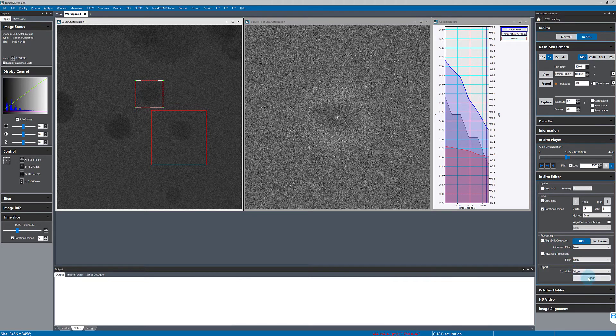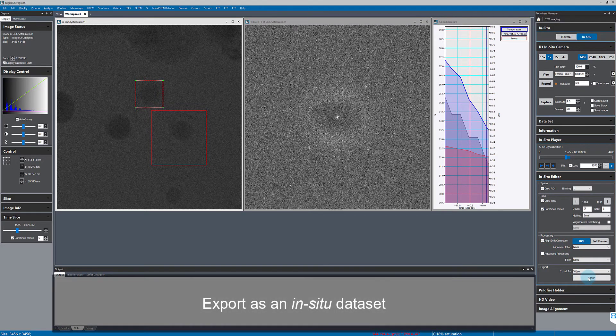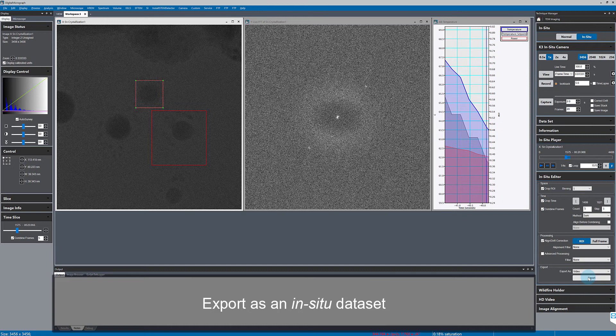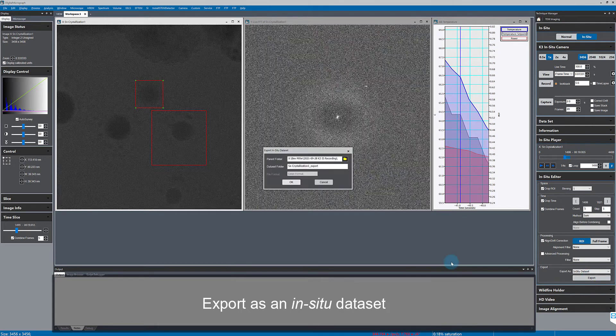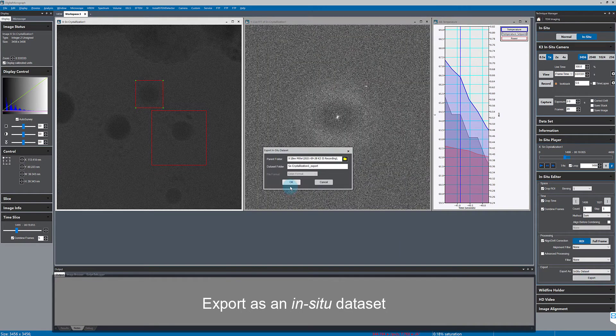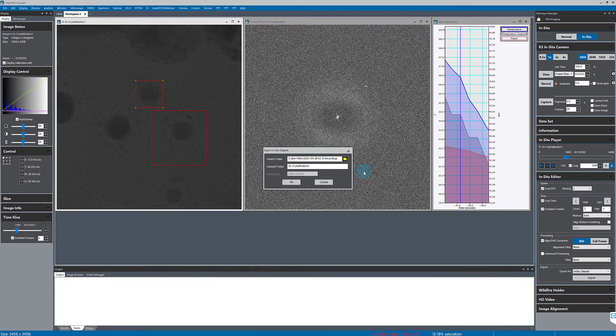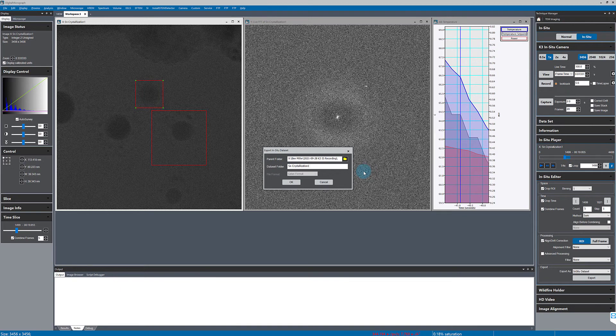I'll then export this as an in situ data set, that means the data will still be in dm4 format with full bit depth, full resolution, and metadata, and without any lossy compression.